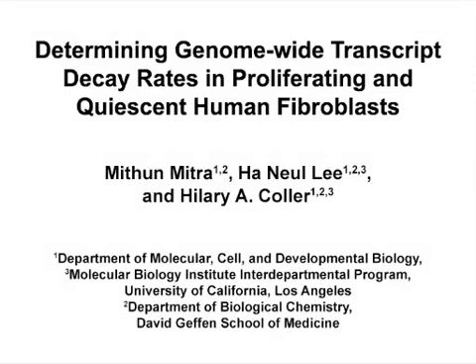The overall goal of this procedure is to monitor transcript decay rates in proliferating and quiescent fibroblasts. This method can help answer key questions in the molecular biology field, such as whether changes in gene expression result from changes in transcript decay rate. The main advantage of this technique is that it provides information on transcript decay rate, not just transcript abundance.